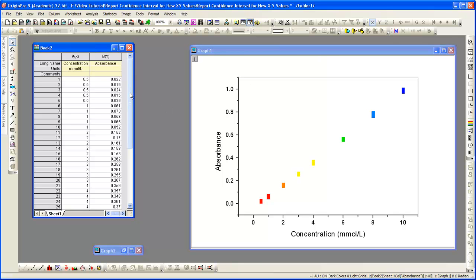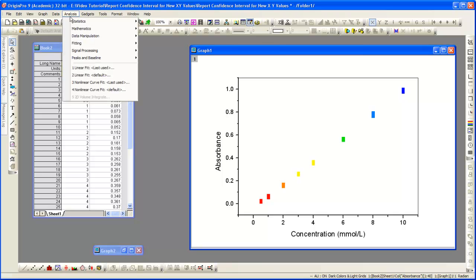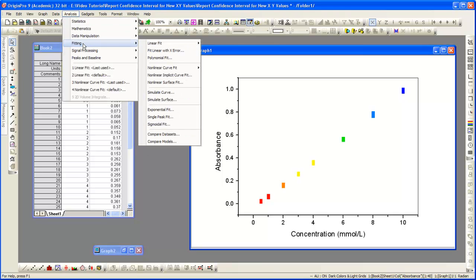The data we're looking at here was retrieved by measuring the absorbance of a series of standard samples. To create the calibration curve, we perform a linear fit of the data. Analysis, fitting, linear fit.